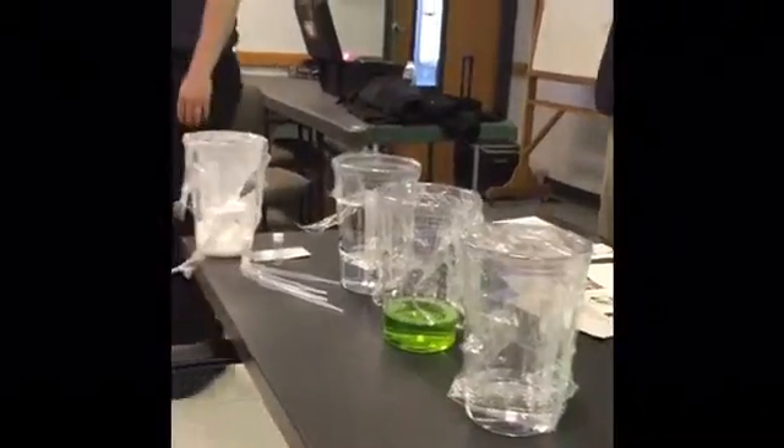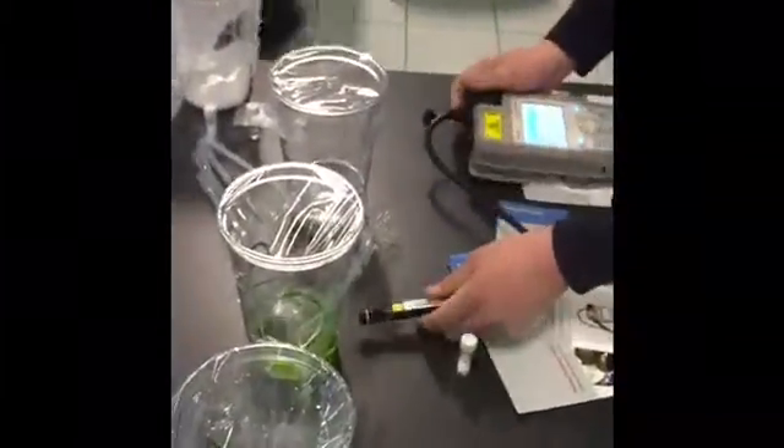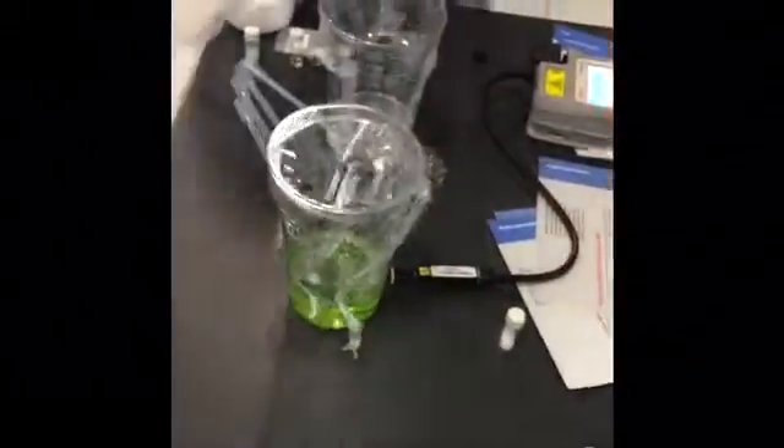Let's try the green one next. The other difference is there is a port for integration with a robot on the RMX. The RMX was originally designed for bomb squads; however, the majority of hazmat units use the RMX now too because of that flexibility. It was designed to work with a robot — you can mount it on a robot, position the camera, drive it up to the sample. We have integration with the Packbot from iRobot and the Talon robot from Kinetic, and we're talking with other robot vendors about adding more integration.